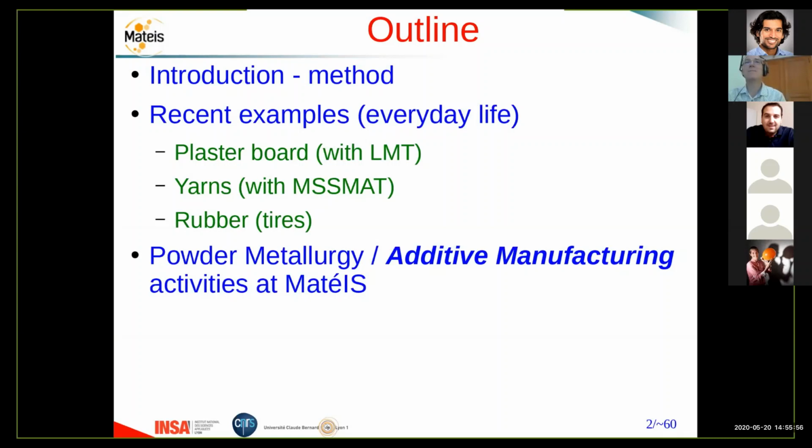Yes, to a big extent. My question is, what if now the models that you use don't work, or they do not work well? How can you inform the models? Can you give more information on what part of the model needs to be improved from the tomograph?